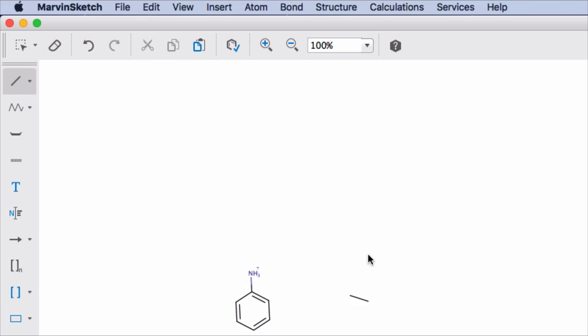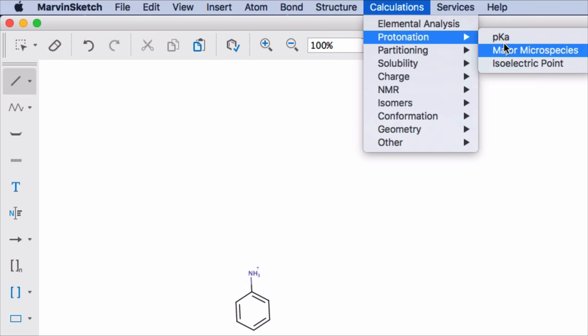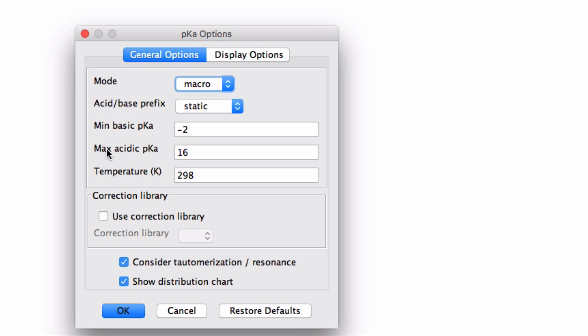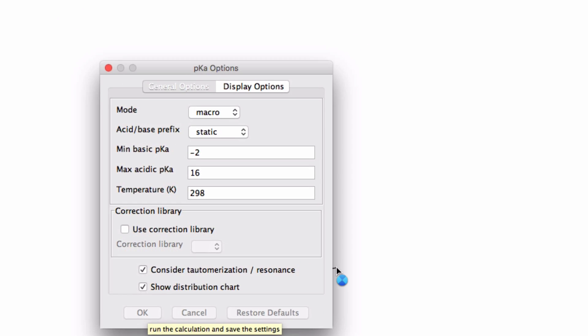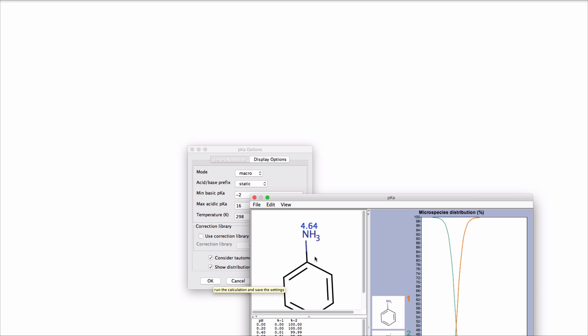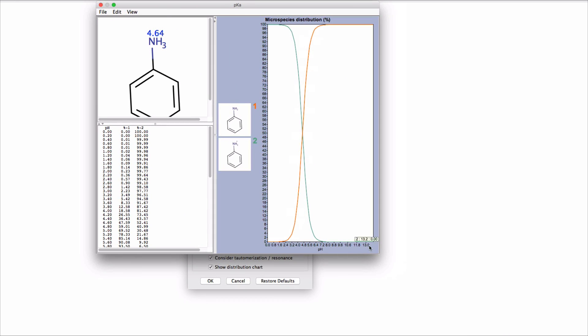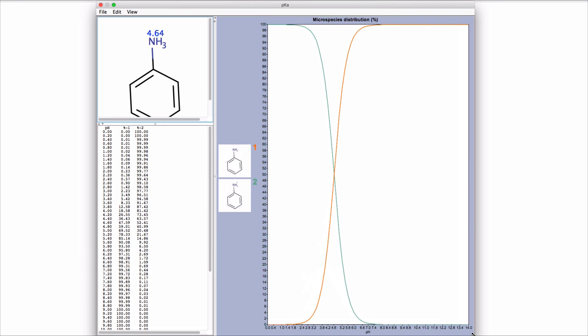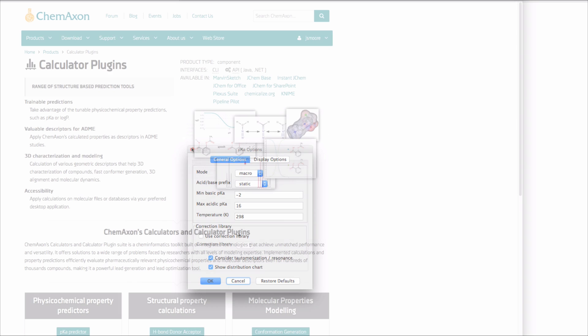In this example I'm calculating the ionization forms of anilinium as a function of pH. Here's that pesky warning message I was telling you about. But as you can see, the calculation proceeds just by clicking OK. The power and ease of use of these plugins makes it worthwhile to get a free academic license.